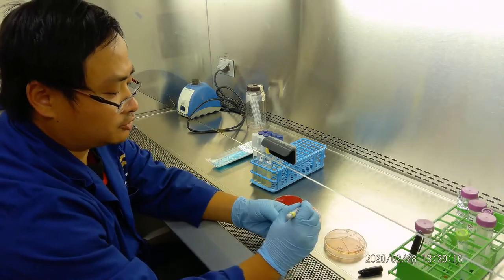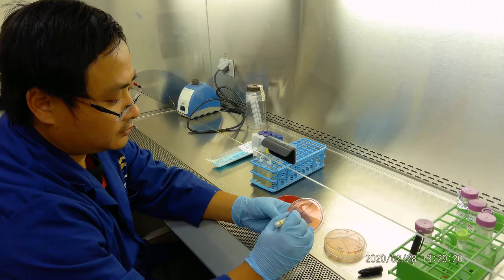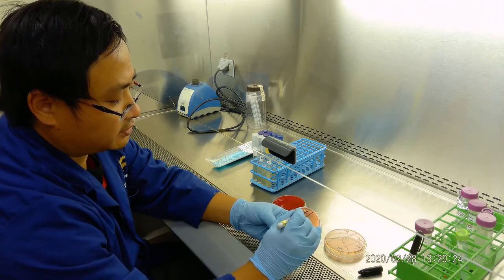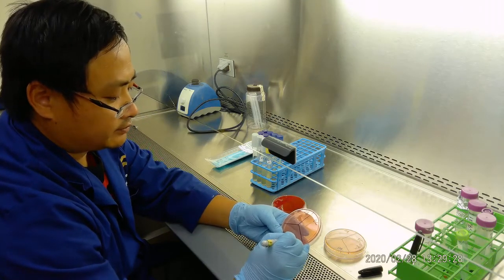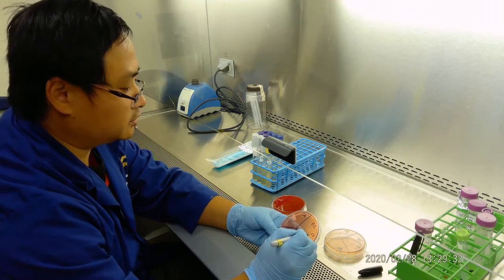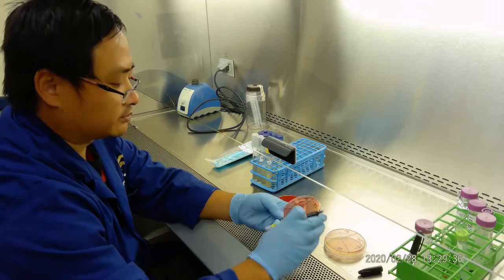Second one, for mannitol salt agar, we also do the same thing. So Lee, also take a picture for this. We have Staphylococcus aureus, E. coli, and Pseudomonas aeruginosa. So we write the initials, date, and the bench number.